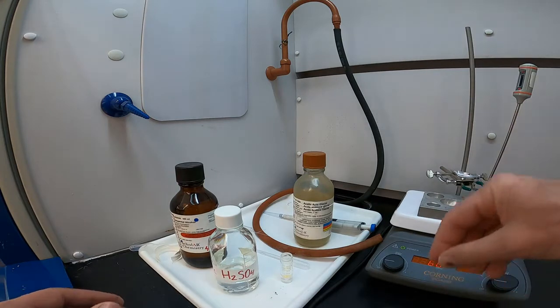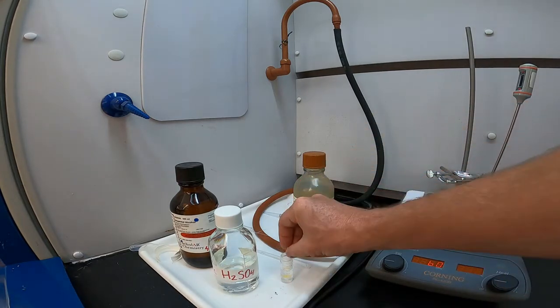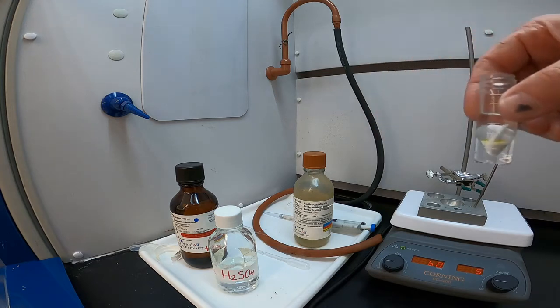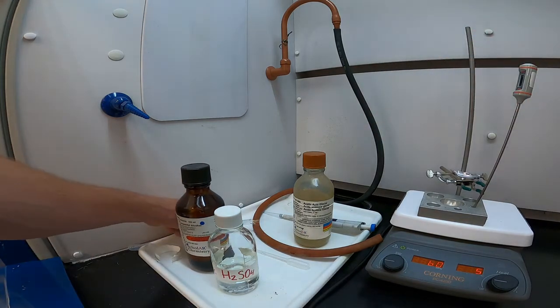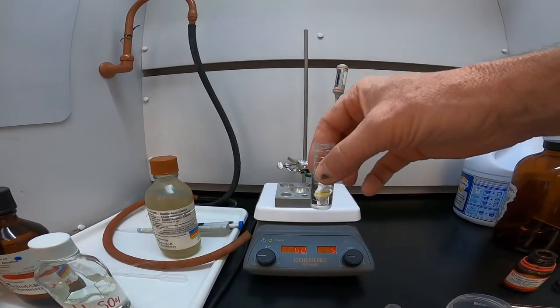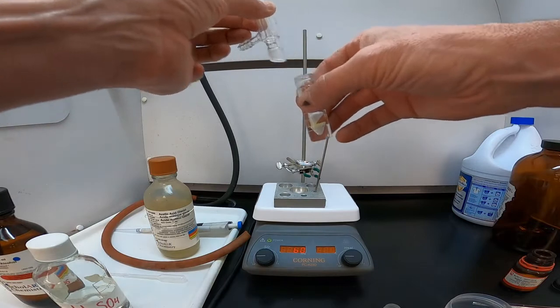And then I'll add the magnetic spin vane. So everything is in there, all of our reactants. And then lastly, I'll attach the reflux condenser.